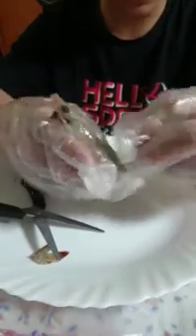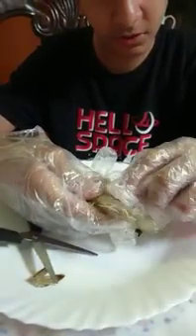And this part, you can see if we remove this, you'll see their digestive system right here in this head.